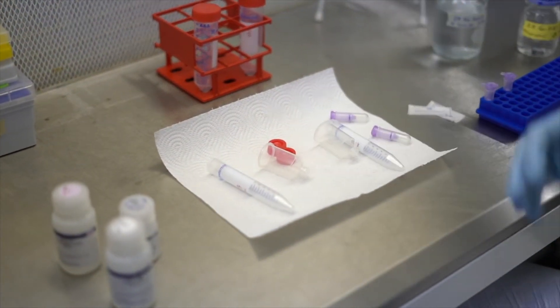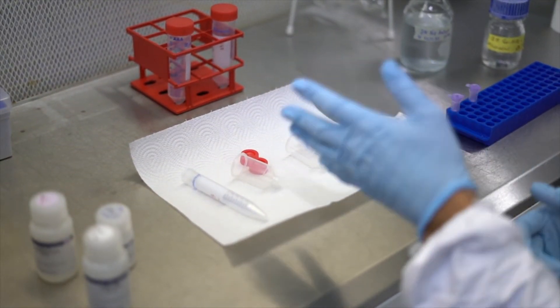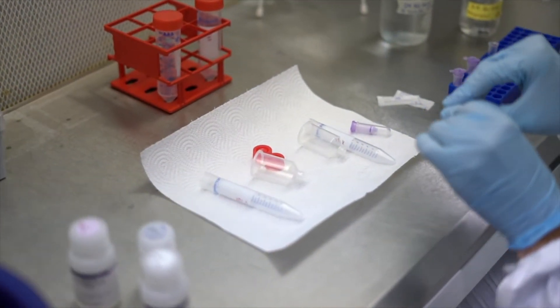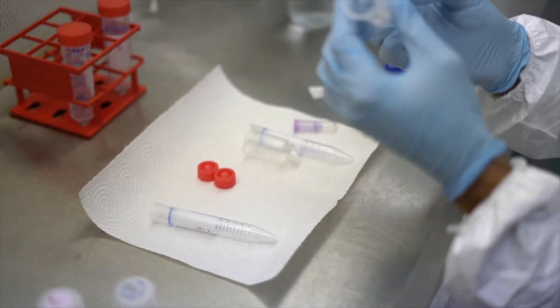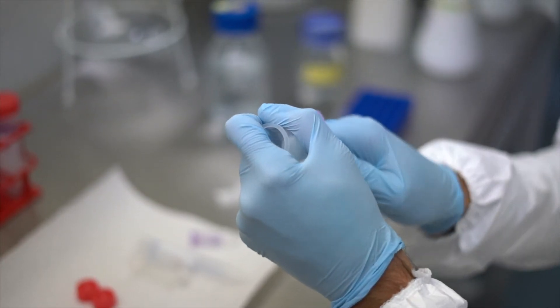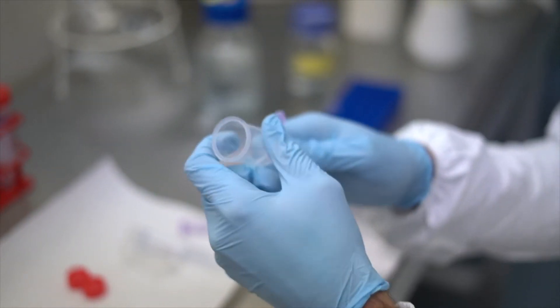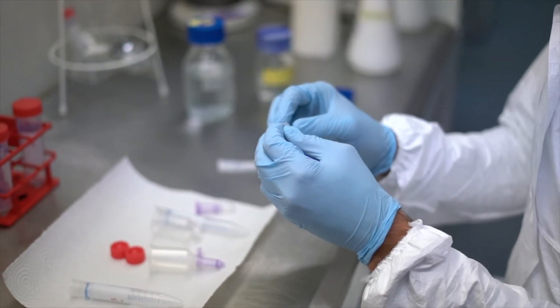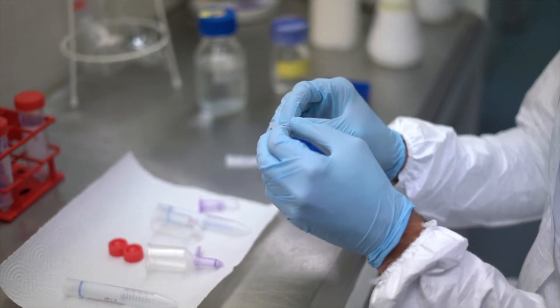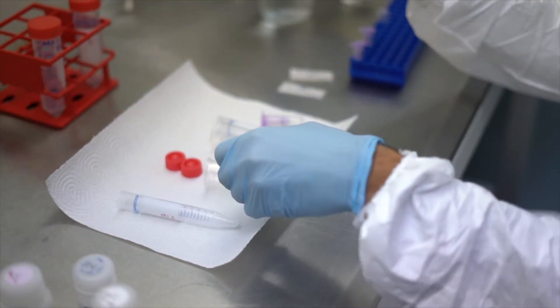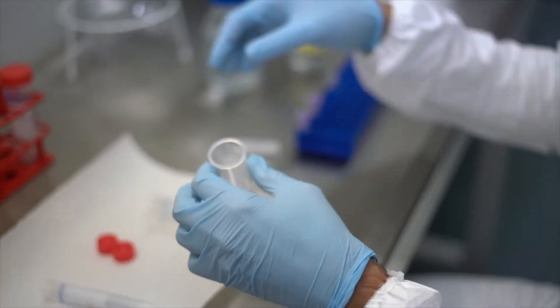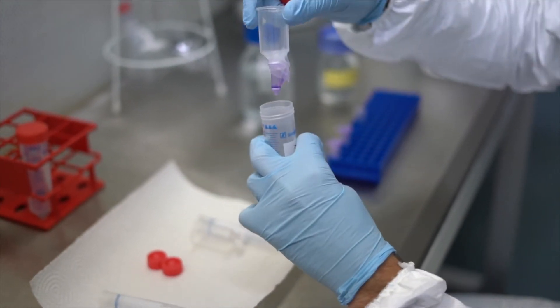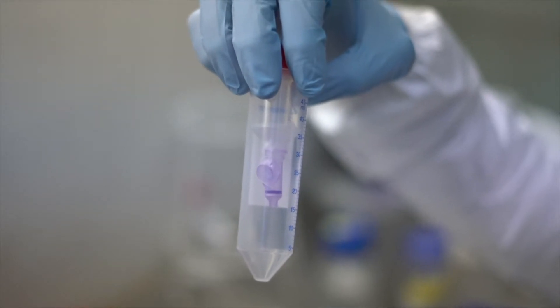For that we need some MinElute Qiagen silica columns and Zymo extension reservoirs. Basically we have to force a MinElute silica column at the end of the Zymo extension reservoirs. We are going to force it very tight so that it won't be lost during the centrifugation. At the end we can also put some parafilm. The parafilm does not really help fixing the structure but it will at least avoid that the lid of the MinElute column will fly around. Finally this structure has to be placed on a 50 milliliter falcon tube. Good, let's start with the extraction.